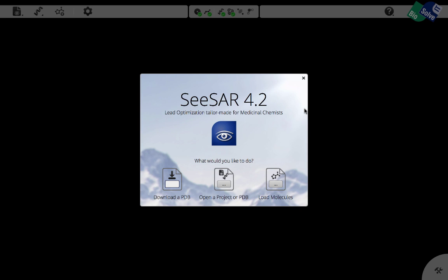With this short video we would like to show you how you can use SeeSAR for evolving a fragment into an underutilized subpocket of an active site, how you can use it for compound ideation and compound prioritization.